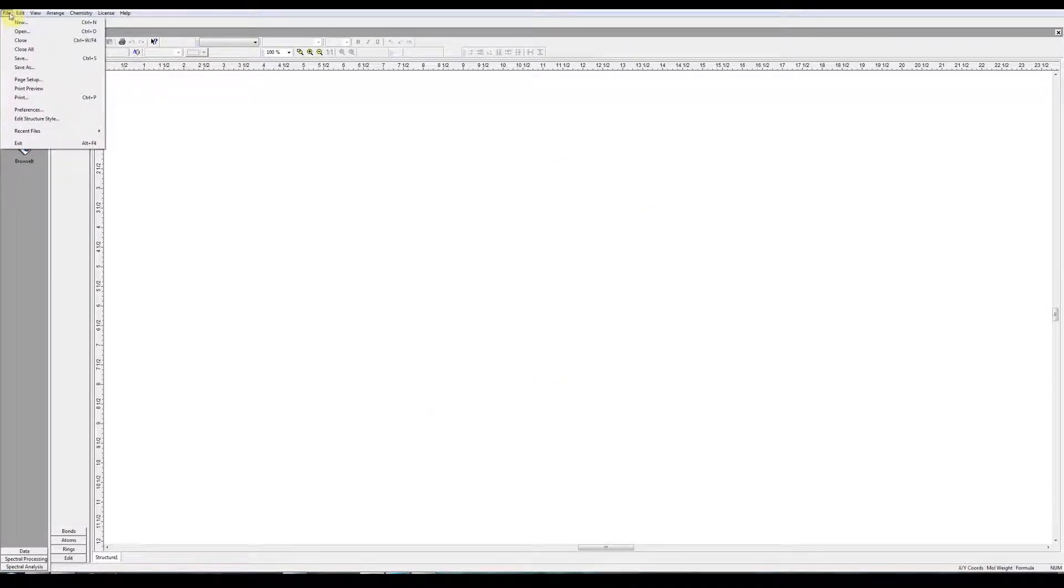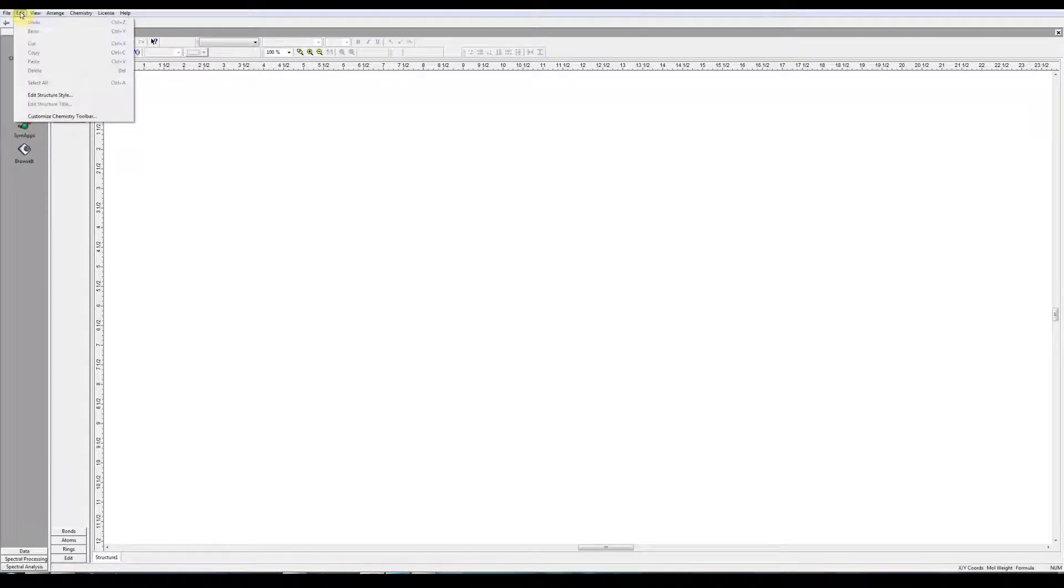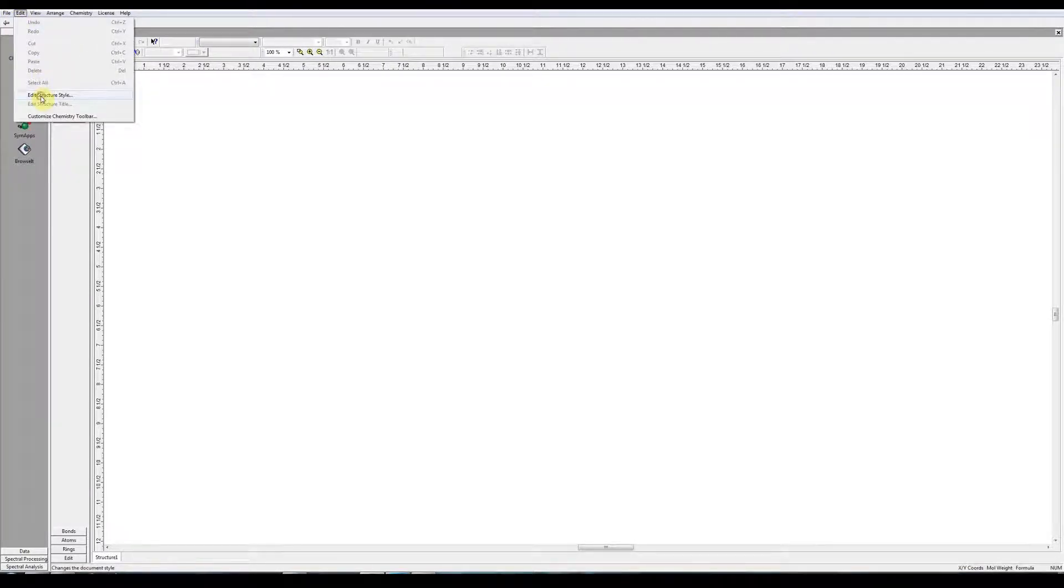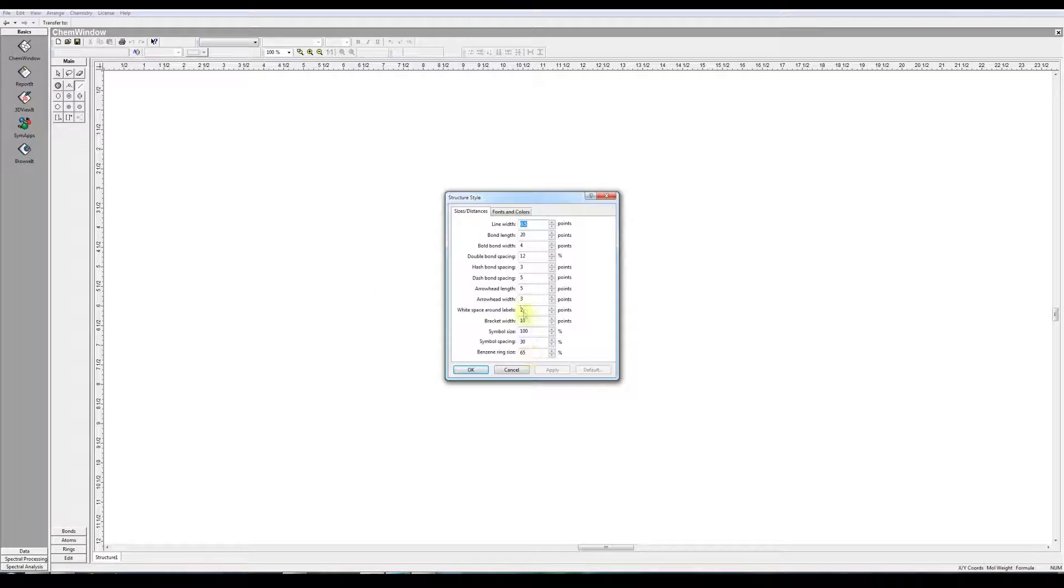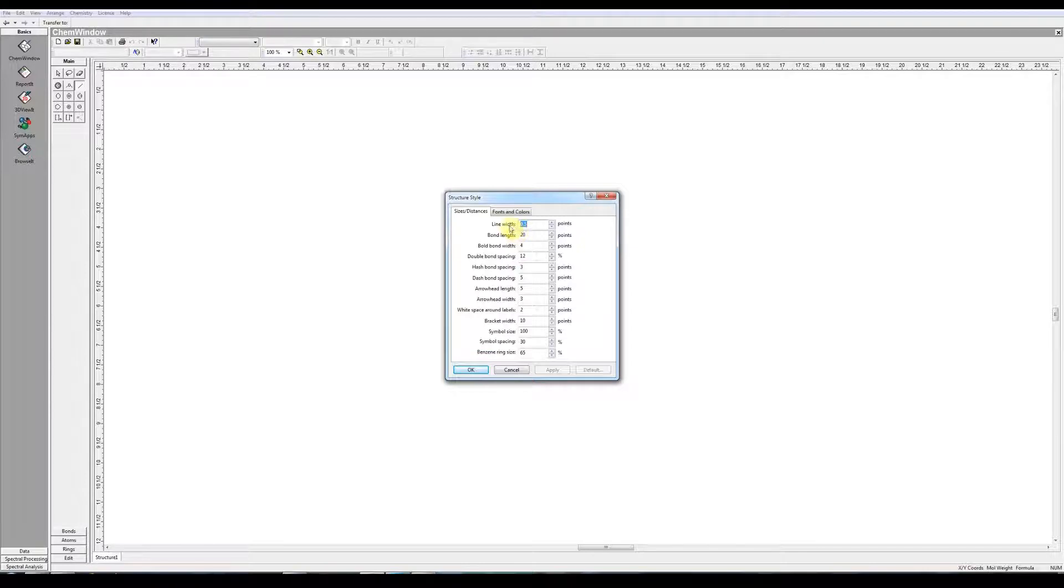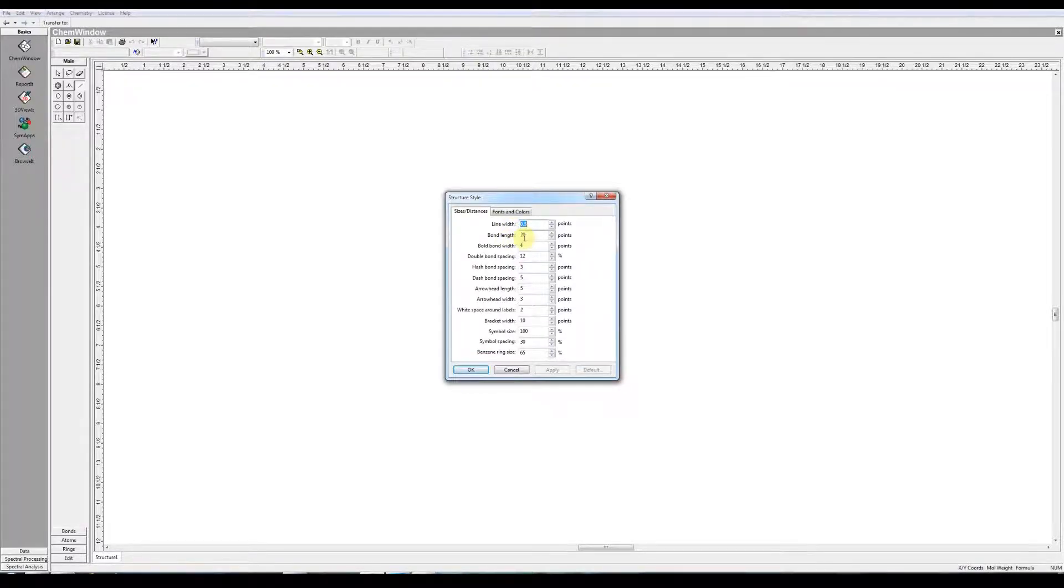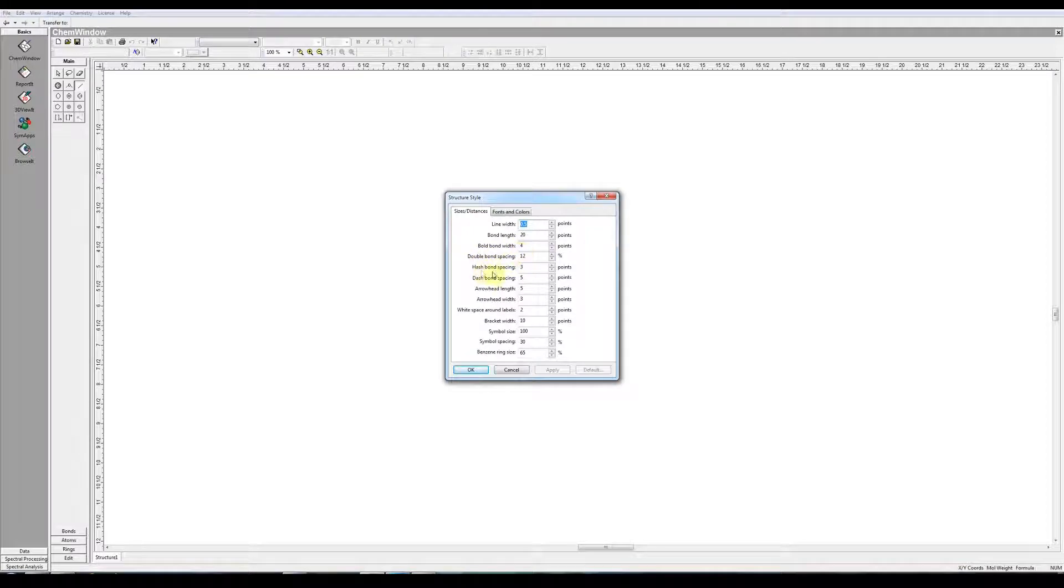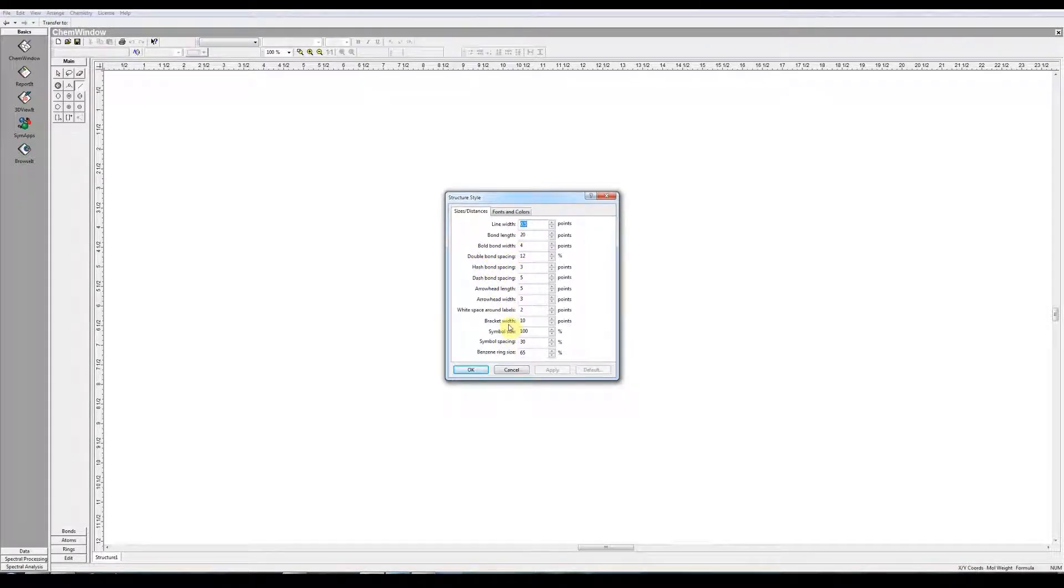Next, choose either File, Edit Structure Style, or Edit, Edit Structure Style. It's the same dialog box. It's quite important. So when you're drawing structures, you can have default settings of line widths, bond lengths, double bond widths, and so on, all these different settings. And this is where you can make changes.